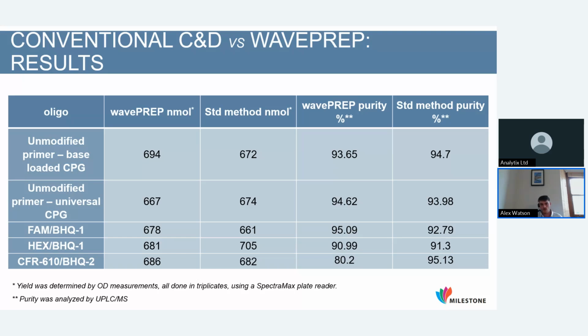Some labs wouldn't mind just using one method. Others would like to tweak it and have different methods slightly tweaked for each oligo to further boost these purities and yields. Considering we're just using one method that's saving us even up to 6 hours compared to their traditional methods, these are really excellent results.